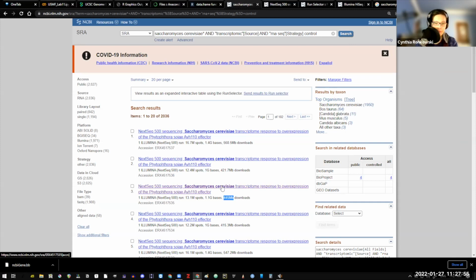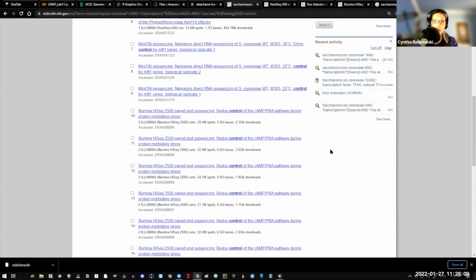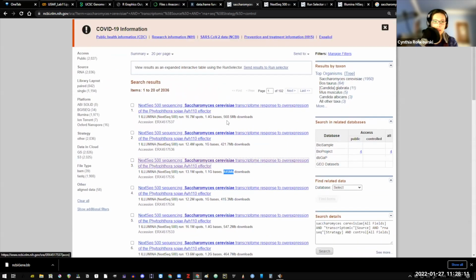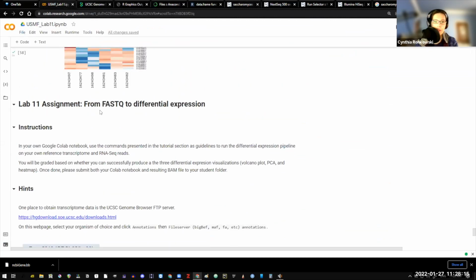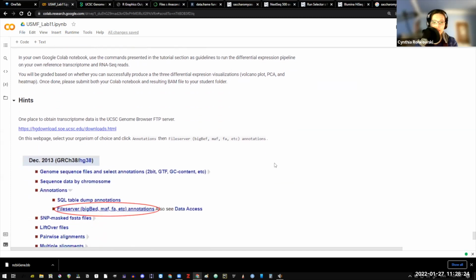But yeah, we won't be talking about the details of quality control, but that might be something you want to look into further in the future, if you want to use publicly available data sets. But just for running the tools themselves for differential expression analysis, that is something that we've shown in the tutorial here, and you'll run it yourself.